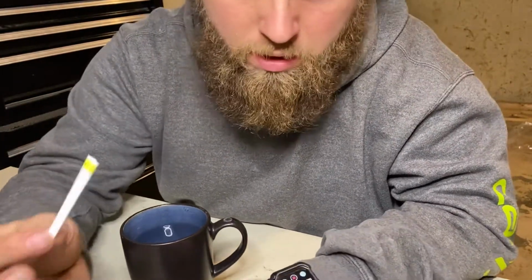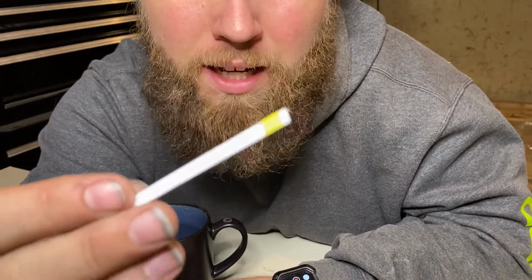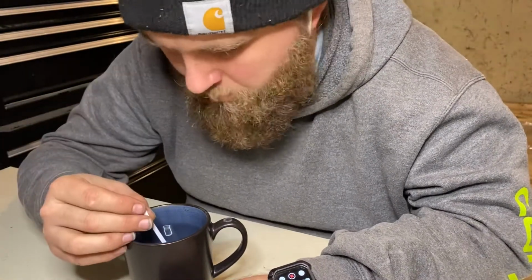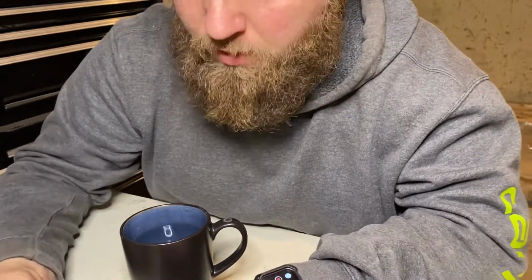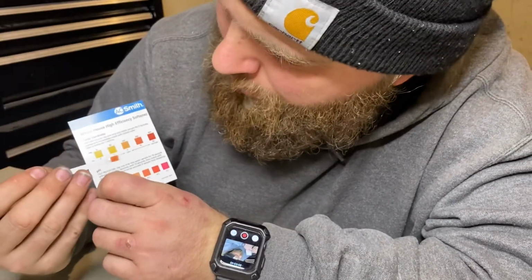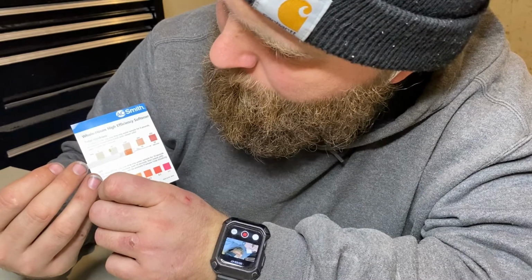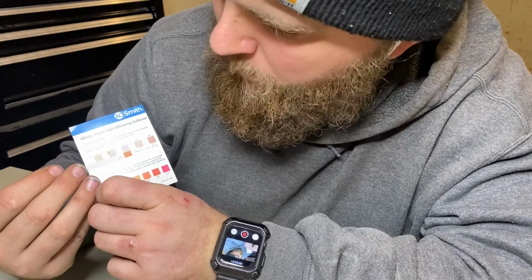All right, so it's got this little strip, little yellow dot. So I'm gonna hold that in there for 3 seconds. And yes, I am a Mississippi seconds kind of guy. 1 Mississippi, 2 Mississippi, 3 Mississippi. And there's my color. Now I'm going to match. It says the color is stable for up to 1 minute. And probably here on 120. Okay, so that's my total hardness, 120.